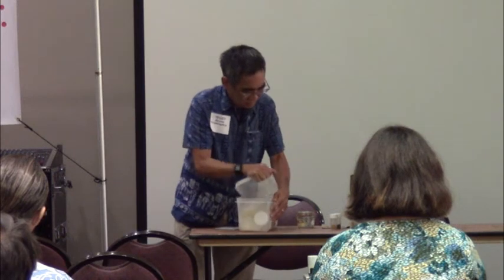Now, take the box out of the refrigerator, put it someplace, and just wait for a while until the box comes to room temperature. You do this because if you don't wait till the box comes to room temperature, the seeds will get moist from condensation because they're cold, right? And then you undo all the effects of that 1 month of drying.